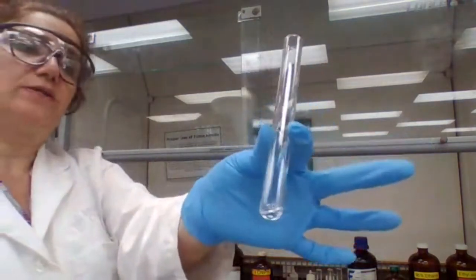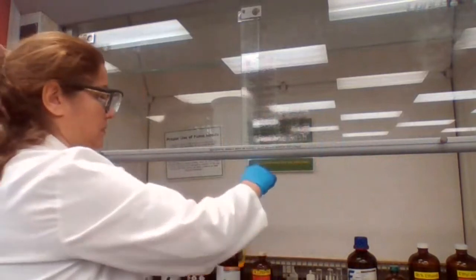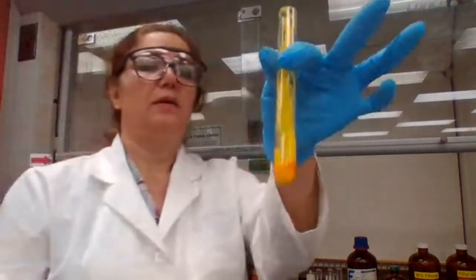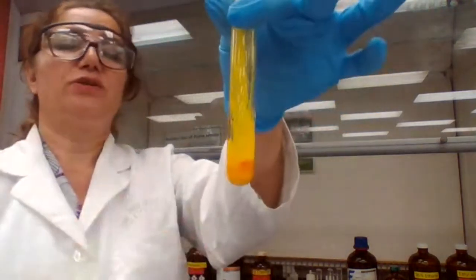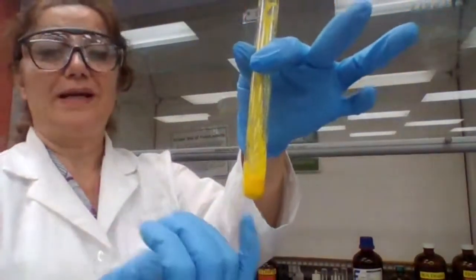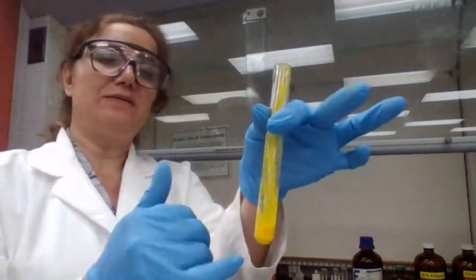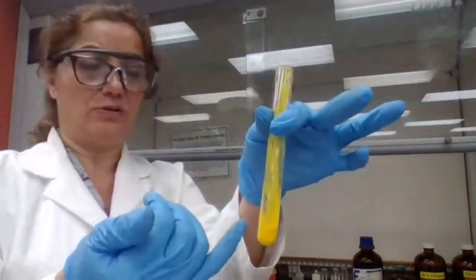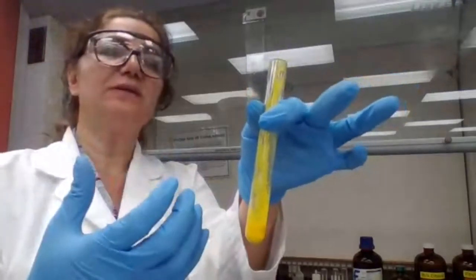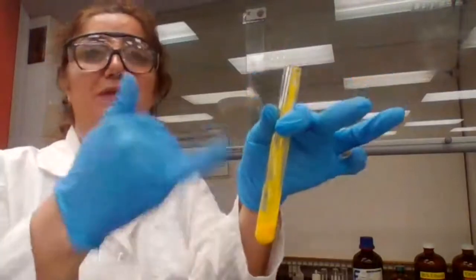So the first compound is cyclohexanone. 5 drops of cyclohexanone, and adding the 2,4-dinitrophenylhydrazine. It changes to a yellow color precipitate. This precipitate is actually the derivative of this aldehyde or ketone, in this case. I can filter it, wash it, dry it, and make this my sample for derivatization.